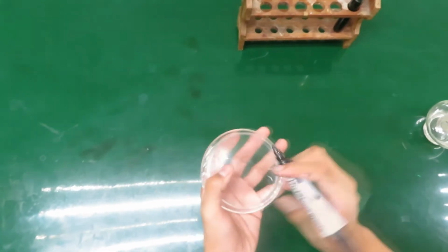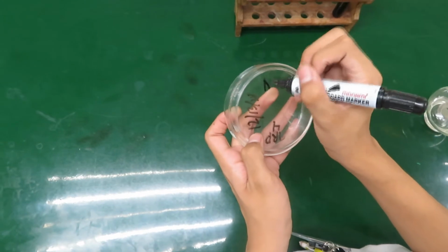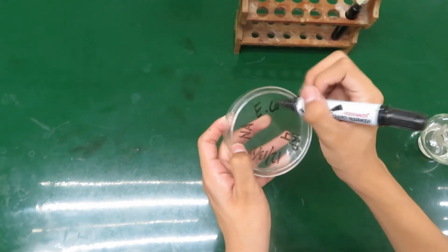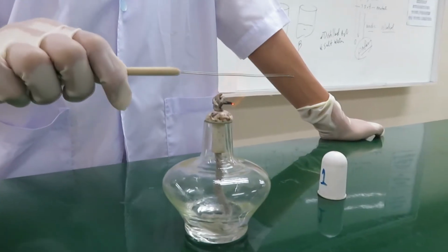1. Label with your name, the date, the type of growth medium, and the type of organism to be plated on the edge of the bottom of the petri dish. Note that plates should be completely dry and pre-warmed to room temperature. 2. Flame the inoculating loop using the alcohol lamp until it becomes red hot.